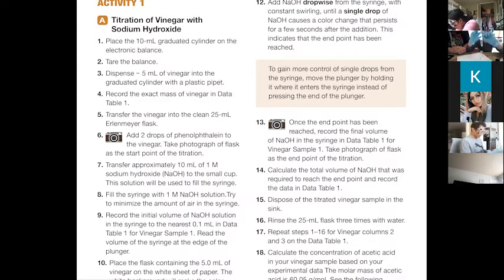Your second and third titrations are going a lot faster because you can zip right up close to the titration point and then slowly go. So even if you go over your first one, you're going to know basically where the titration point is. You don't have to go half mil by half mil, because you know approximately where it should be. So we know ours is going to be around 4 mils. So we sort of just went right to it. And now we're going to start going drop by drop. Oop. Over already.